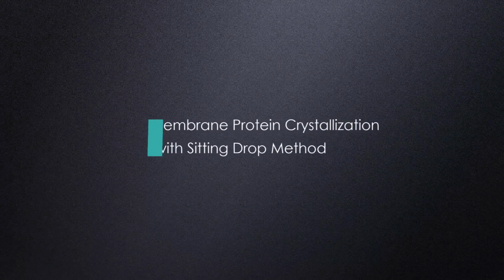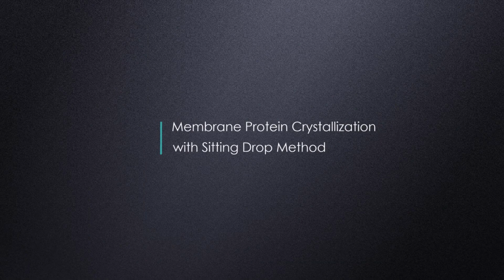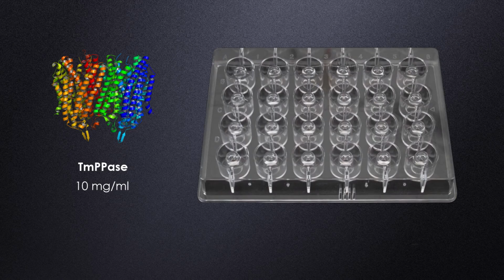Membrane protein crystallization with the sitting drop method. In this experiment, membrane-bound pyrophosphatase from Thermotoga maritima with a concentration of 10 mg/ml will be crystallized using the sitting drop method.